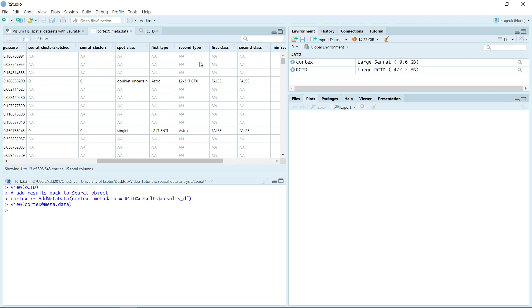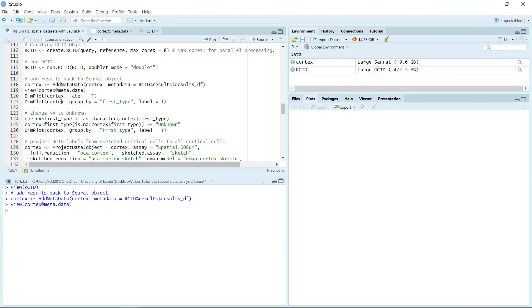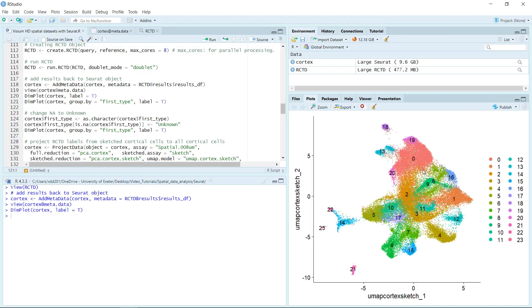Because we have the cell type information in the metadata, now we can use the dimplot to have a look at the cell types. First, we can just run dimplot for the cortex. At the moment, the default C is the sketched C. Let's run. Let's zoom in — you can see we still have 24 cell clusters here.